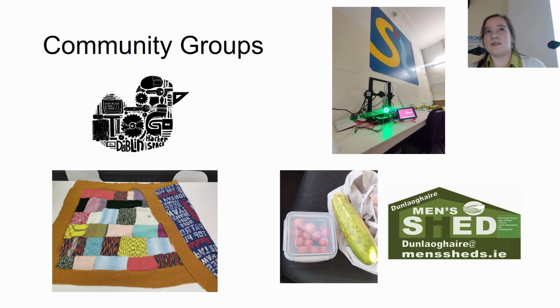The reason why they want the EnderScope is quite interesting, because they're not particularly interested in the final product. They are more interested in the process of building the microscope together, because it's a vehicle for socializing. So I think they're a really interesting group to work with. So I'm excited to see what their feedback is.